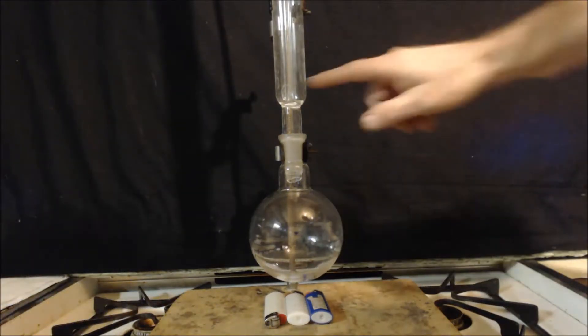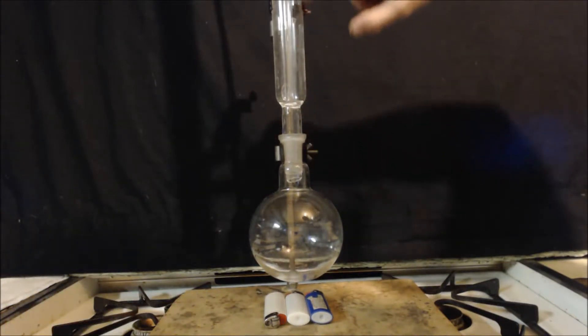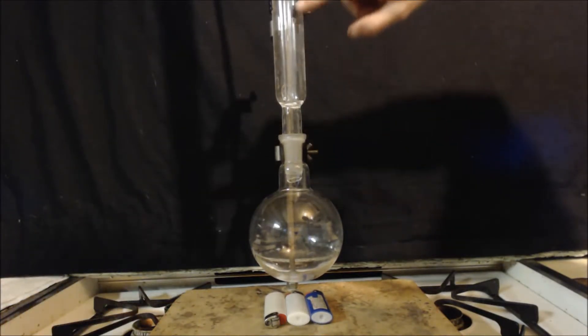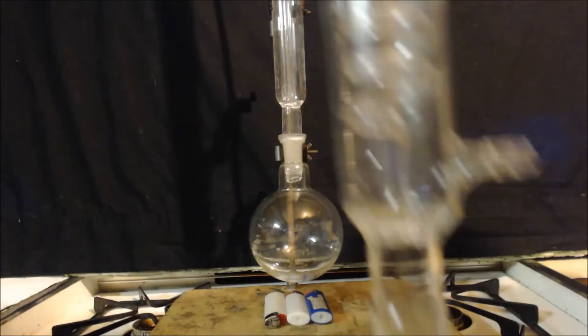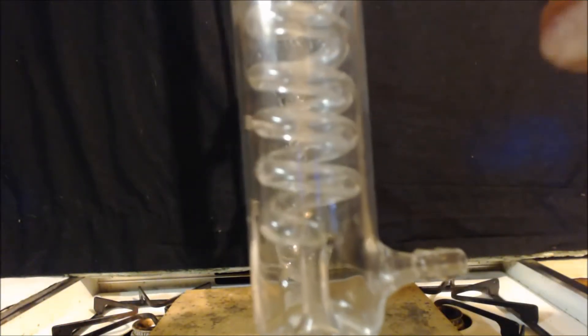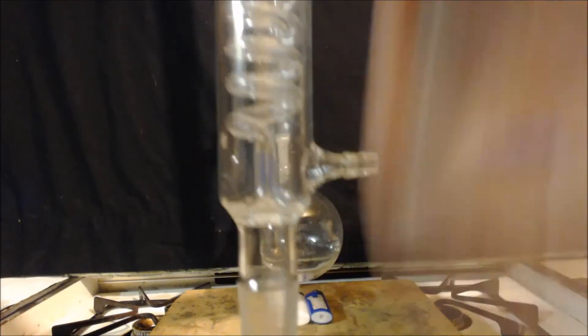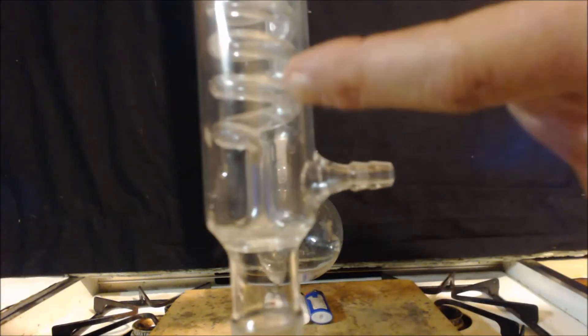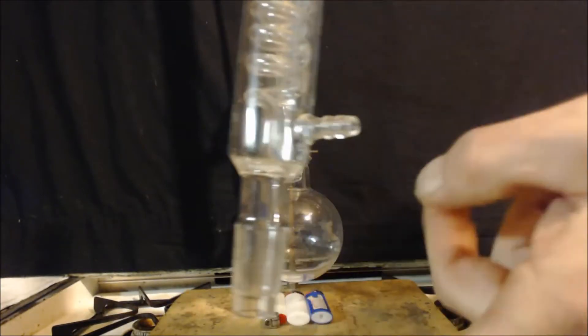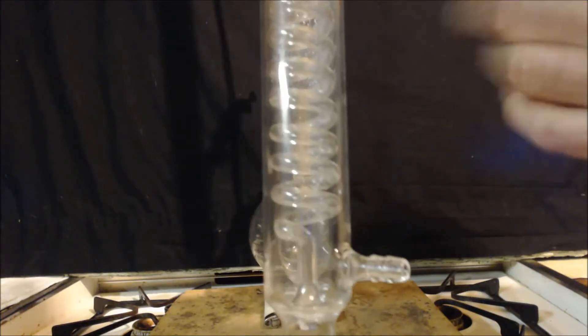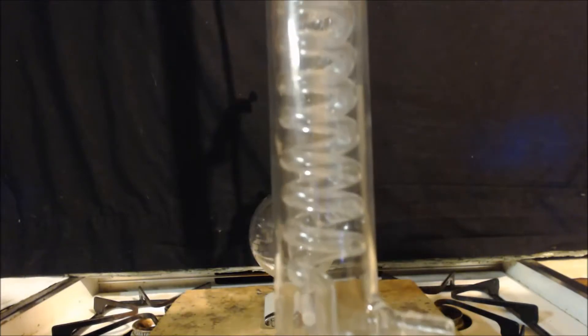But see if you think about it, this straight one, when the gases come up, it has nothing really to block it. It will eventually touch the sides, but there's nothing really to block it from going straight up. If you look at this, each one of these coils, it's going straight up right, heat wants to rise, it's going to hit each one of these coils. And there's a bunch of coils in here. So each time it hits this, it has a big chance of turning into a liquid and going back into the pot. That's why this is so much better. Because instead of it going just straight up the pipe and hitting the sides eventually, it's definitely going to hit it before it gets to the top of this.